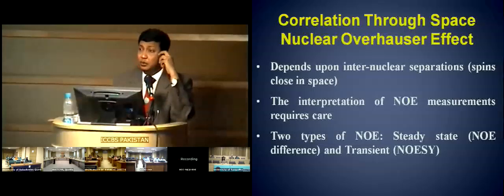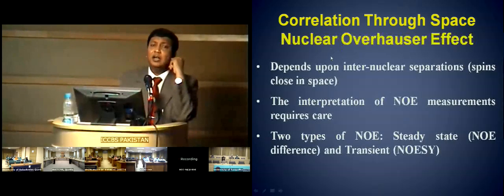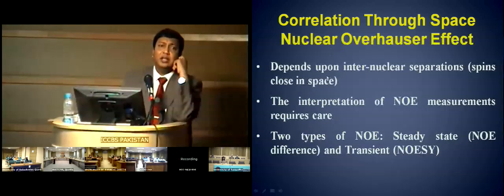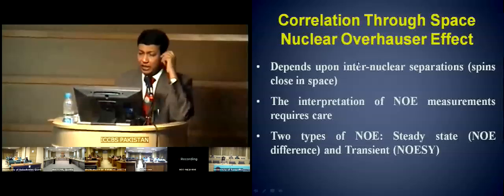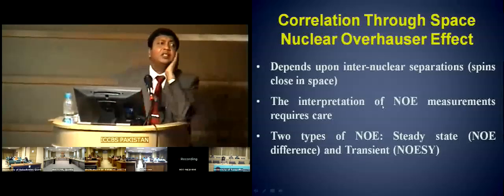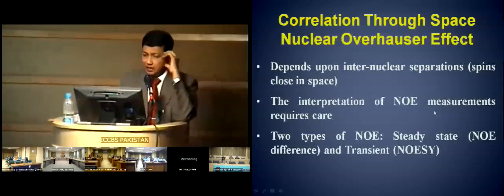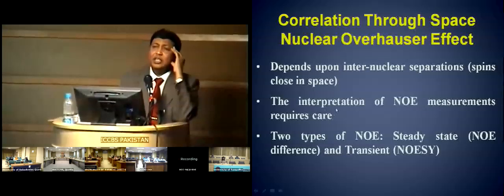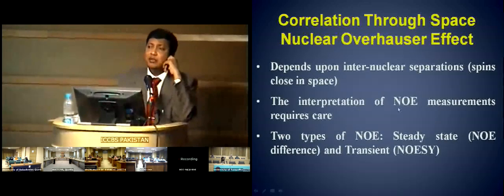And NOESY was used so profoundly and so strongly by Professor Wüthrich's group in ETH, Switzerland, where they were able to demonstrate that they would be able to see the linkages in conformation by using an NOE. NOE is a dipolar, geometrically close coupling, based on dipolar couplings. On the other hand, the interpretation of NOE is extremely tricky, very, very tricky.